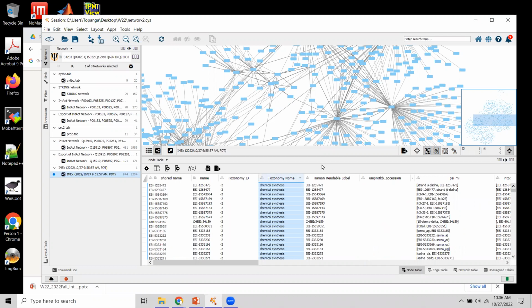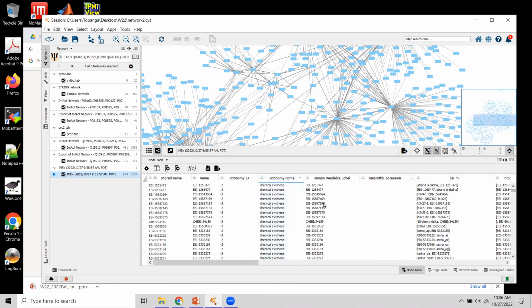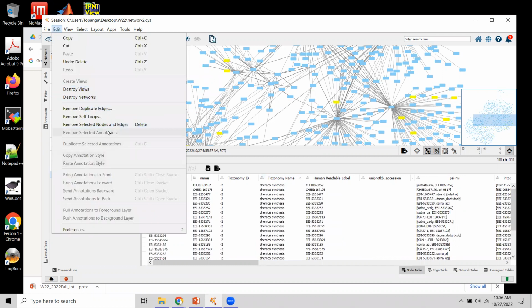Okay, so we have the selection fine. Here to, so, and then right, okay, and now select from, same drill as before, from selected, and then edit and remove.